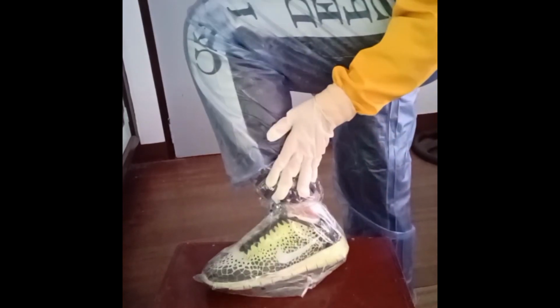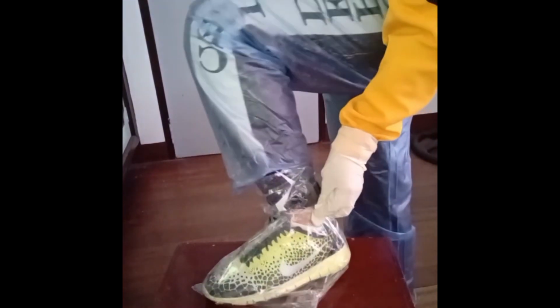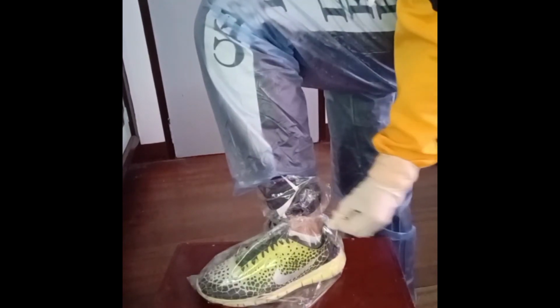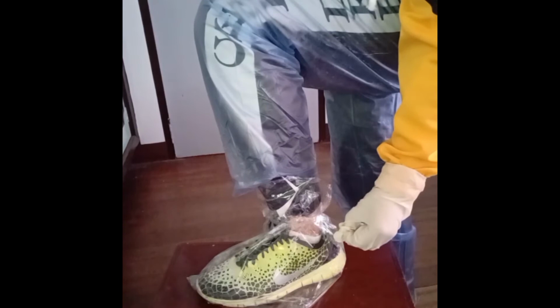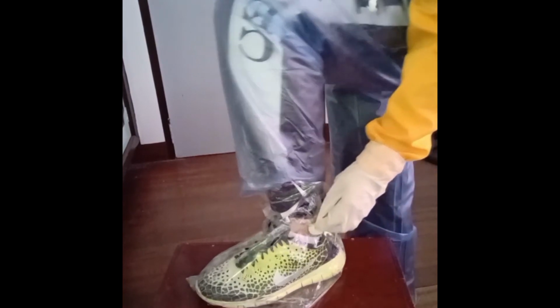This makeshift shoe cover may be achieved by wrapping the whole shoe in plastic by tying the material close, as done by other members of the group, or by using rubber bands to do so, which can be observed here. Since this is only a makeshift shoe cover, there are advantages and disadvantages with the techniques mentioned.